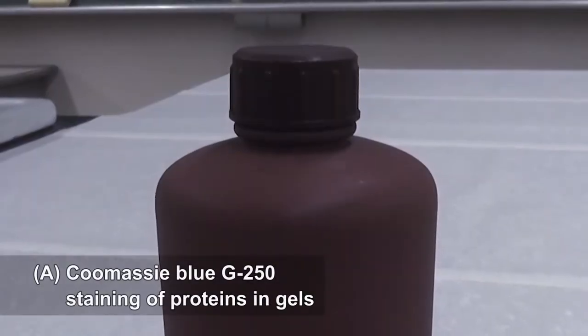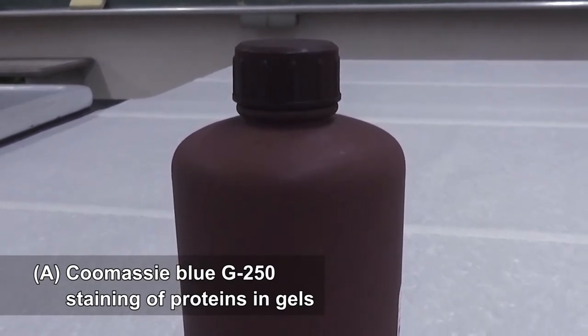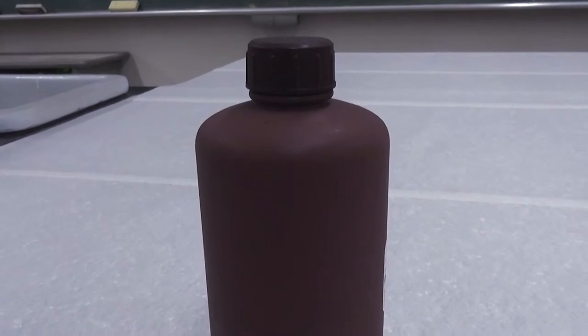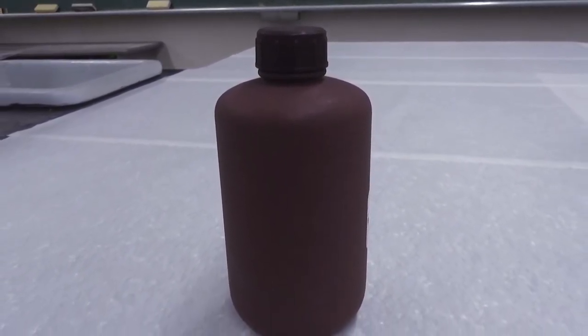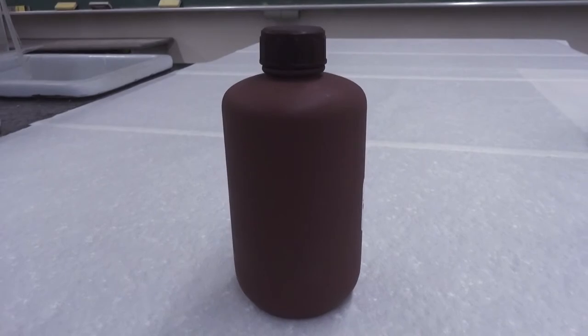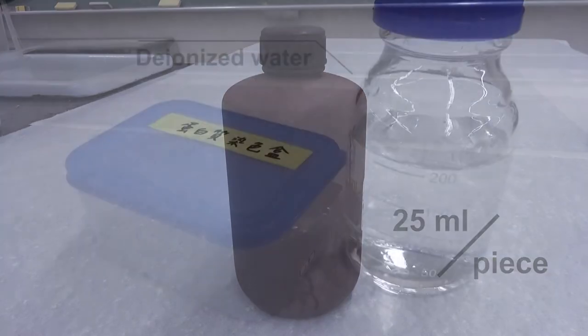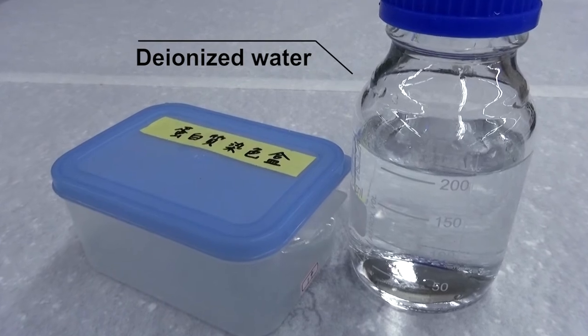A. Gel Staining Coomassie Blue G250 Staining of Proteins in Gels. Here we demonstrate the protocol of Coomassie Blue G250 staining. Please prepare the staining solution before disassembling the gel cassette sandwich. One electrophoresis mini gel will need 25 ml of staining solution. In addition, have the staining box and deionized water ready to use.